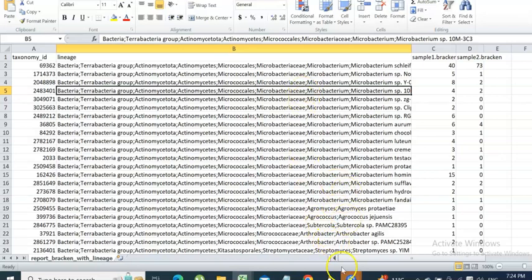But having all these steps in place, by now you should be able to generate files that contain all information necessary for downstream processing, such as identification of differentially abundant taxa across groups. There are quite a lot of programs and packages that can perform this type of analysis. So let me know in the comments if you'd like me to show you how you can do that in another tutorial. I hope everything was clear.